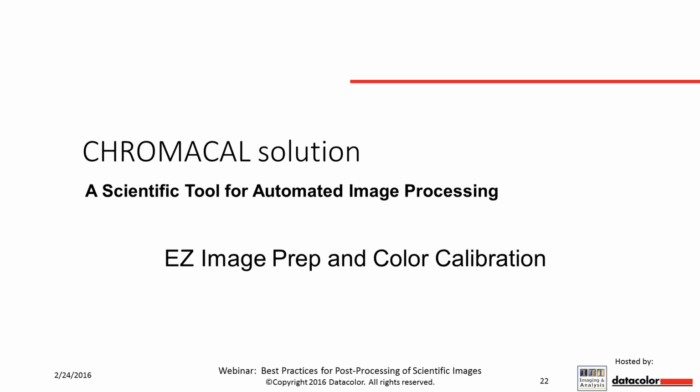So the way that it's being delivered is you can buy it in 2 different packages. One is the Easy Image Prep, and that one is the software only, where it will do the white balancing, it will do a consistent brightness level, and it will do that among various microscope sessions and with a variety of magnifications. But it will also do color calibration to an objective standard, to actually a color target. And that really takes the subjectivity out of setting colors for your images.